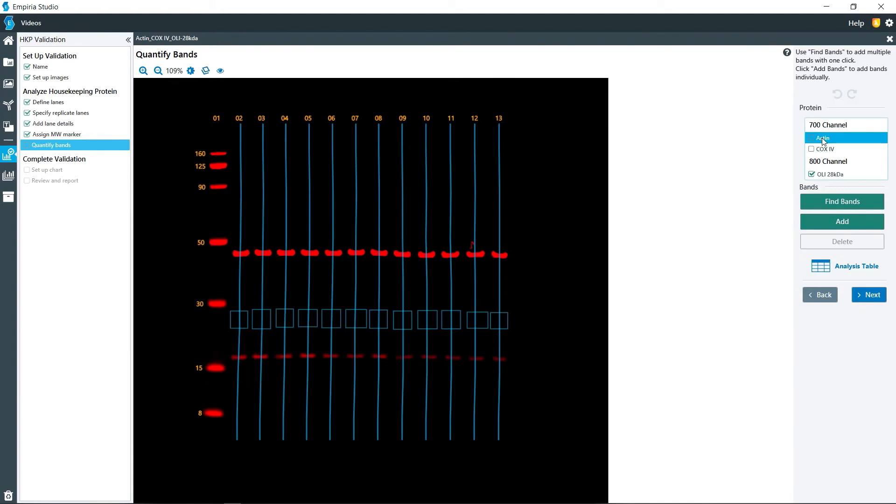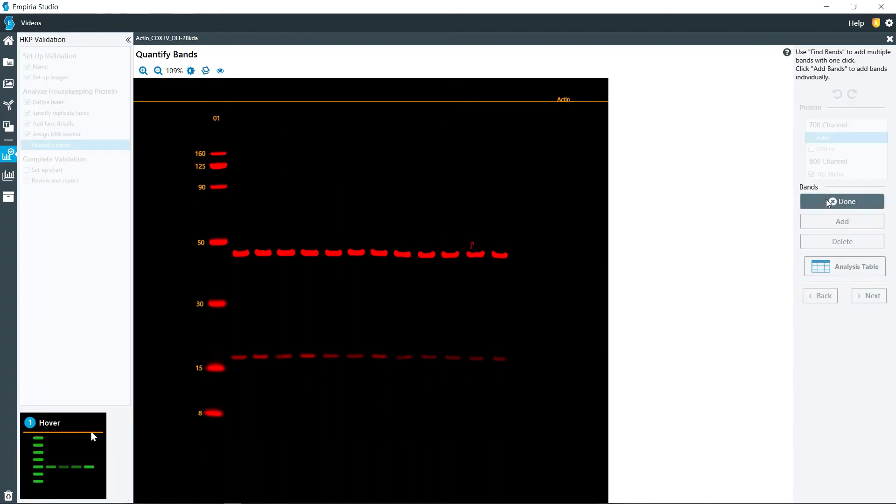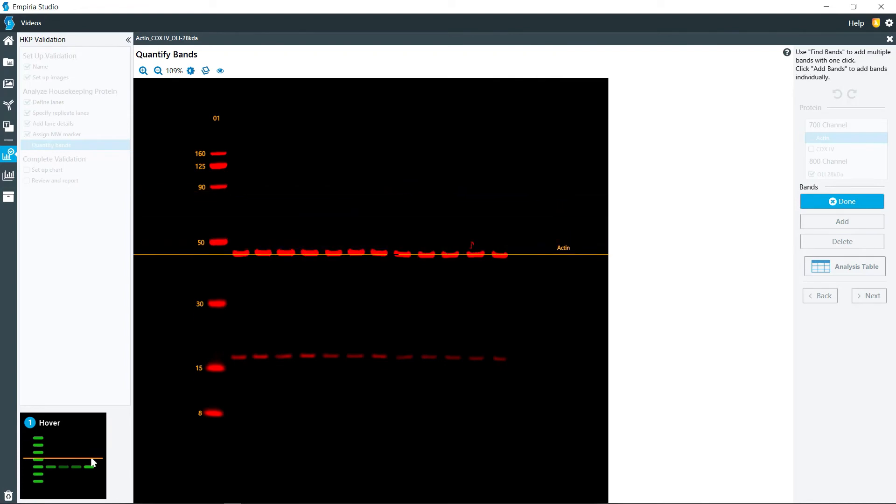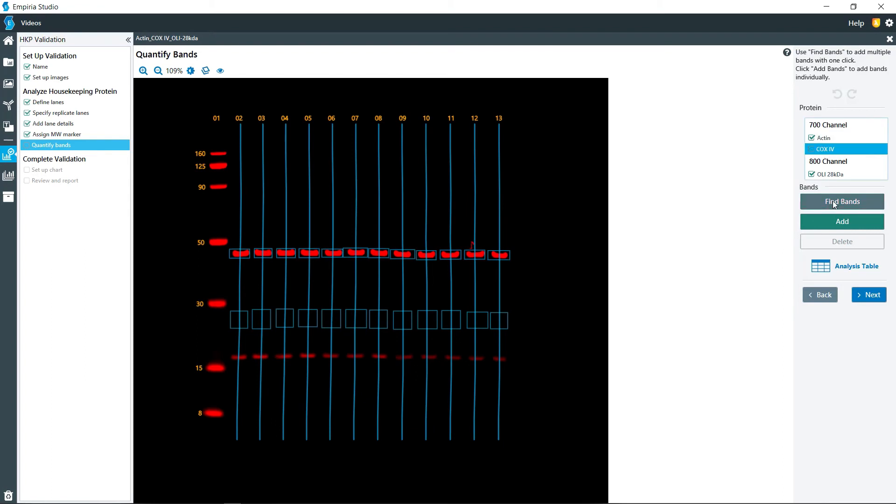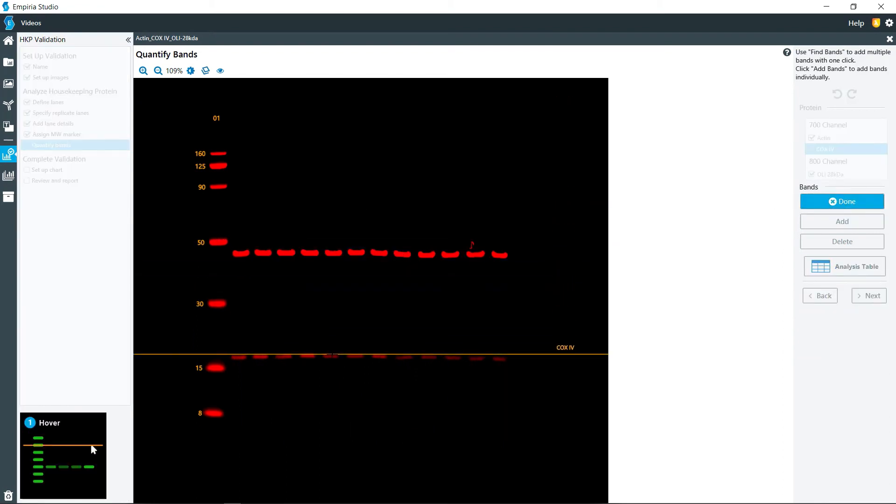So then in the 700 channel for my actin, I do the same operation. I click find bands again, and then those are added on there. And then if I click on COX-4, click find bands and do the same operation again.